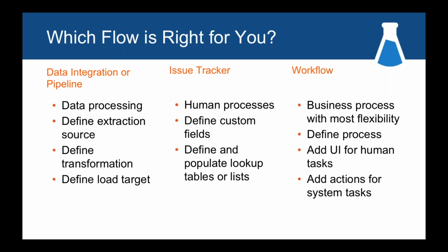If you have something more complex than that, where you want to combine data processing and human processing, then you probably want to look into the workflow module. There you will define the process using some tool, define that XML document, and then probably you will want to add some custom UI for your human tasks that are particular to the type of object that's being worked on. And if you have system tasks, then you would need to add actions for those tasks as well.